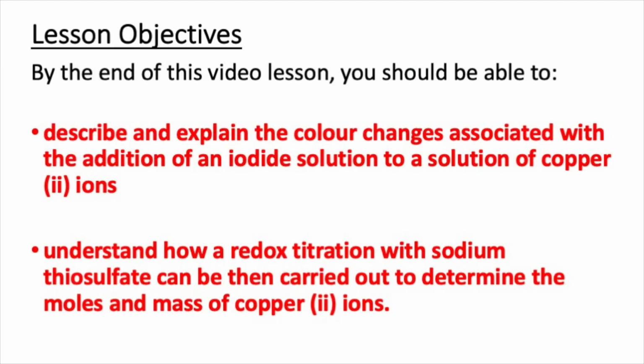By the end of this video lesson, you should be able to describe and explain the colour changes associated with the addition of an iodide solution to a solution of copper 2 ions. You should also understand how a redox titration with sodium thiosulfate can then be carried out to determine the moles and mass of copper 2 ions.